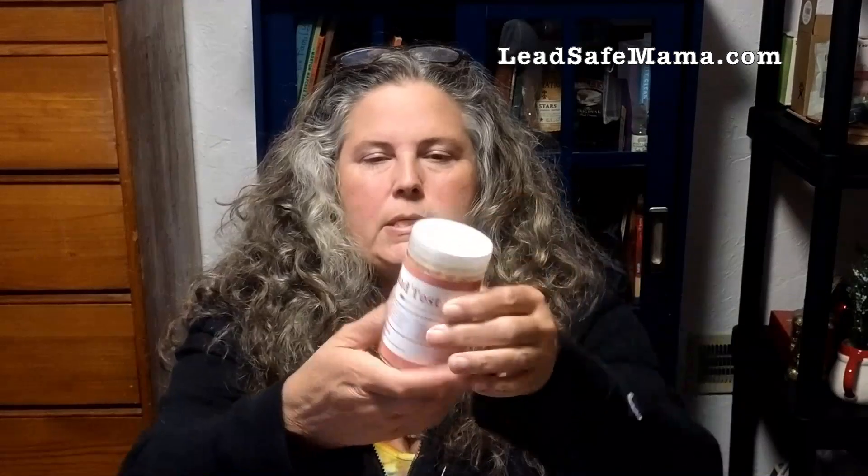One thing I want to let people know: this is a Chinese knockoff of an American company. The formulation on these is not effective — it comes up with false positives and false negatives. So it's really effectively the same as taking your money and throwing it in the trash.